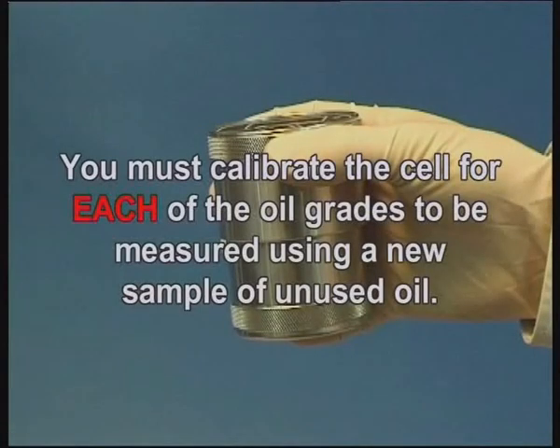You must calibrate the cell for each of the oil grades to be measured using a new sample of unused oil.